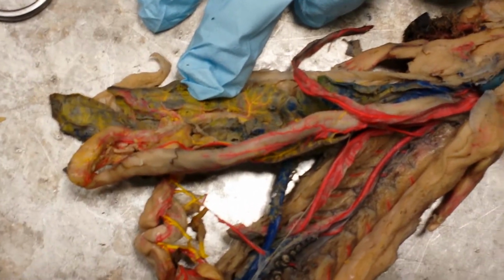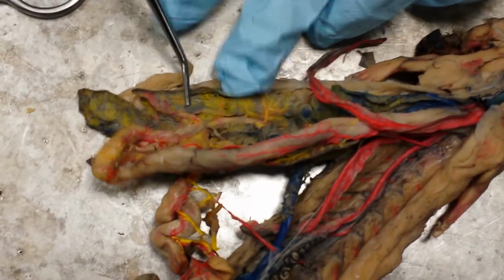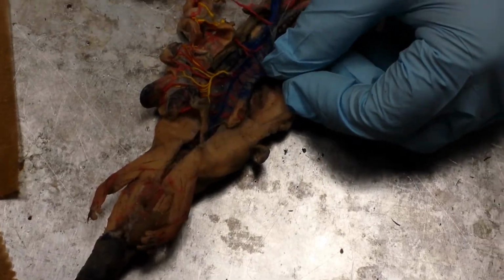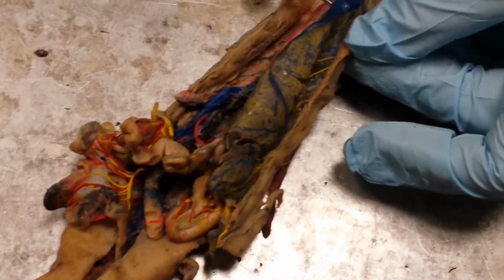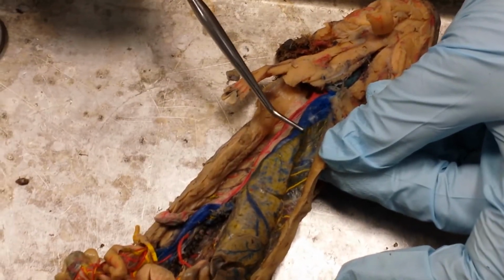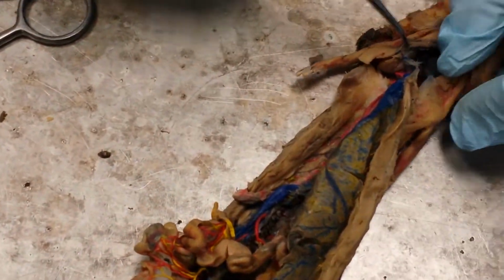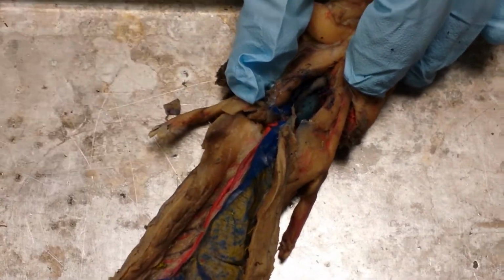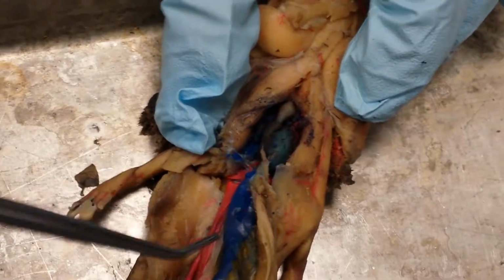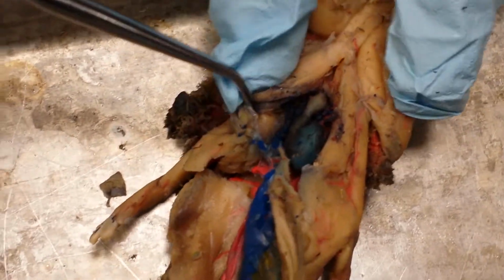Okay, so from your mesenteric veins to your hepatic portal vein, you also have blood draining from the posterior part of the salamander into the post cava. Everything goes into the liver, and from the liver, it's pumped into the post cava again. That's more anterior. And blood from the post cava drains into a sinus venosus, just like in the shark. Okay, so that's right here, and it always falls apart because it's really small and flimsy in the mud puppy. So blood from the body is being drained in the post cava into the sinus venosus.